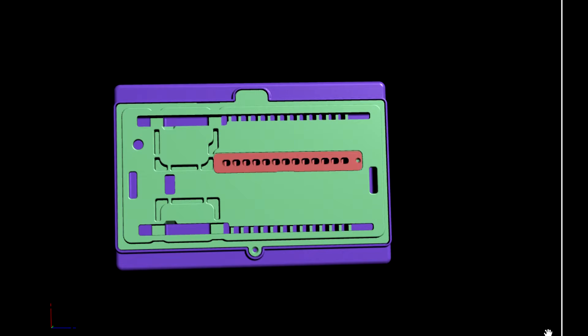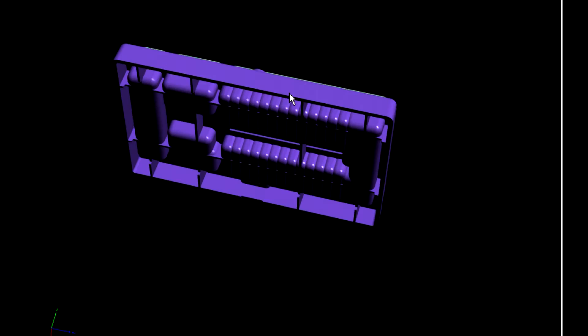This schematic shows the top view of a gel cassette. The three colors represent the three molded components of the assembly.